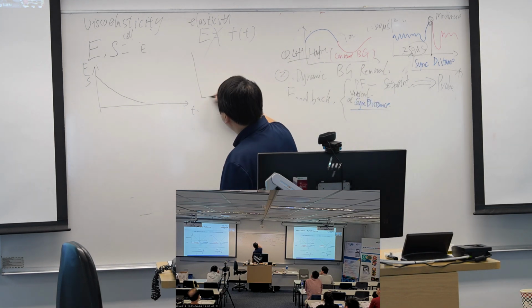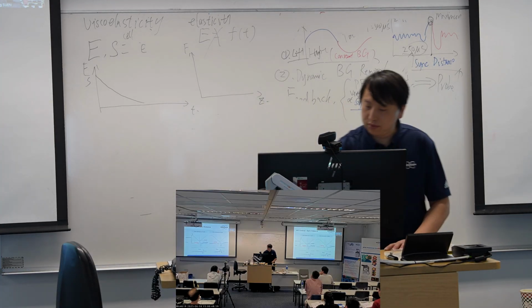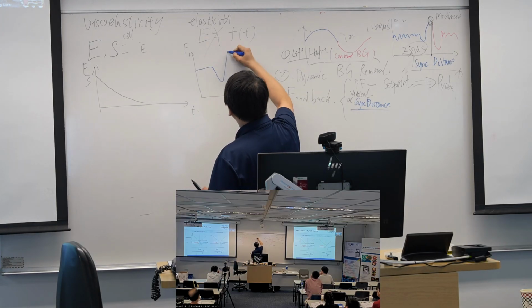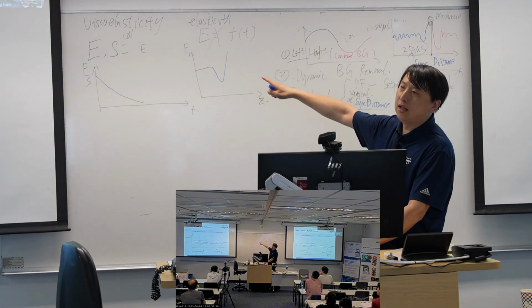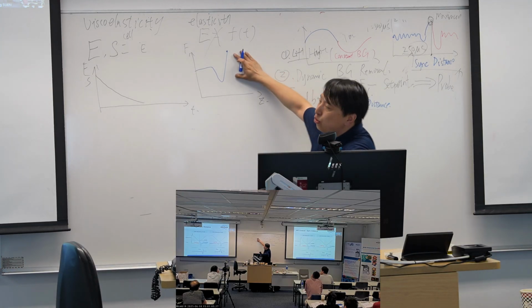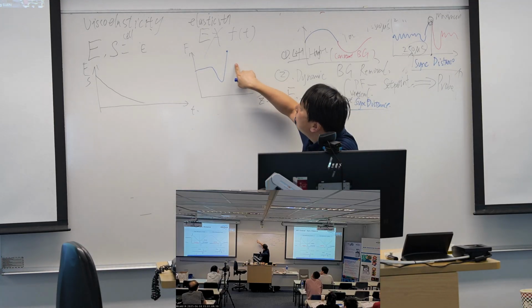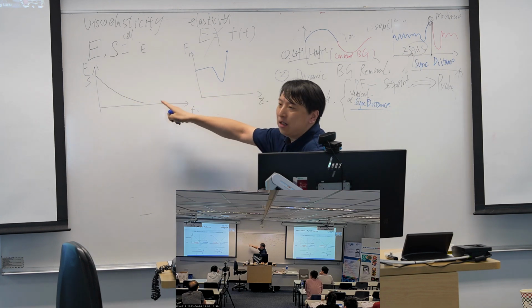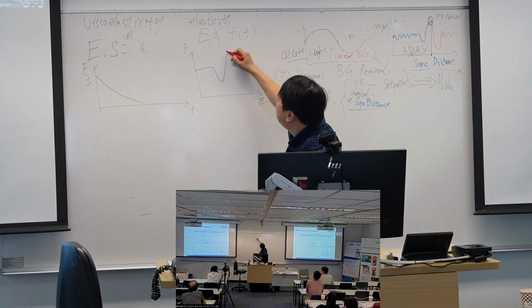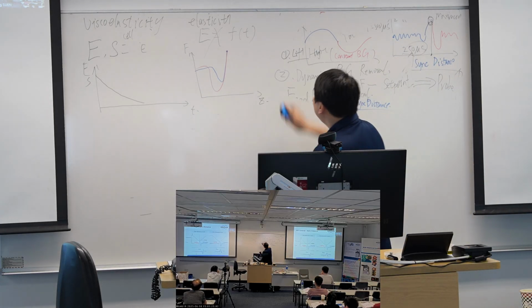So now we are doing a force curve. I compress on my cell. I reach my maximum force. And then I assume I do my force curve quite fast. And then with the cell, I did not sense my cell getting softer. I already retract back. Then it's quite easy.